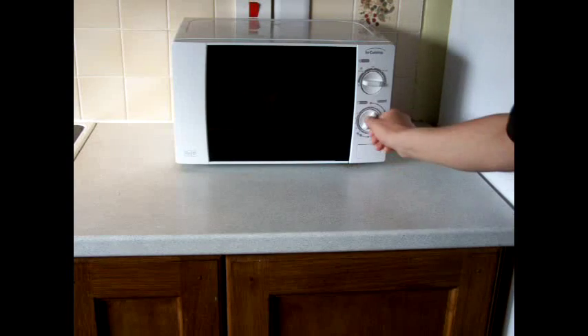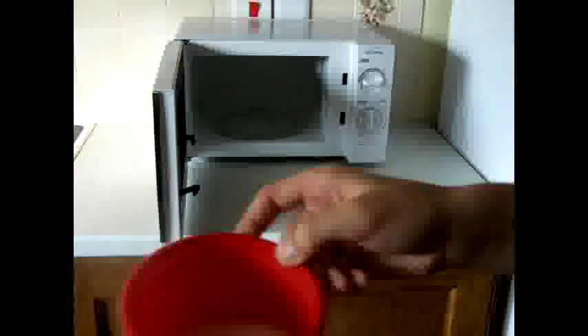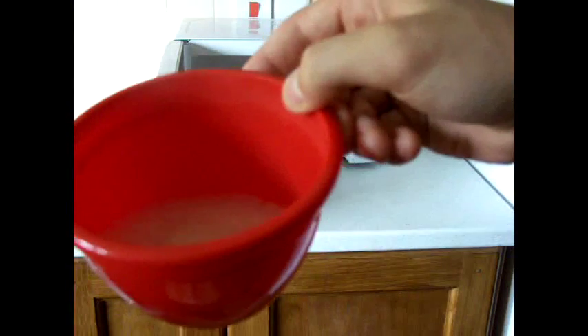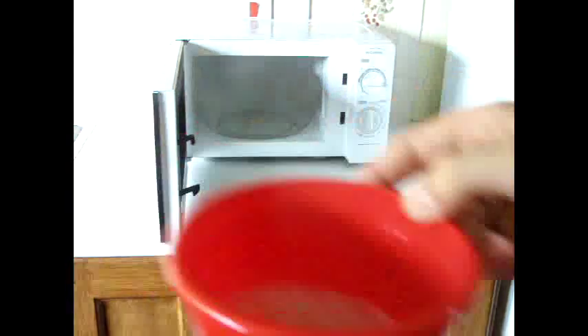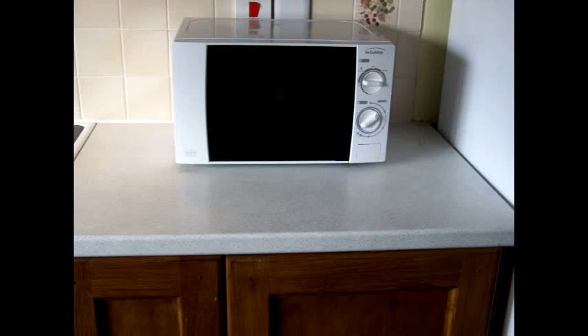When it starts to froth, turn it off and take it out. Wait for it to stop frothing, then put it in again until it begins to froth. Repeat this process until it has frothed three times.